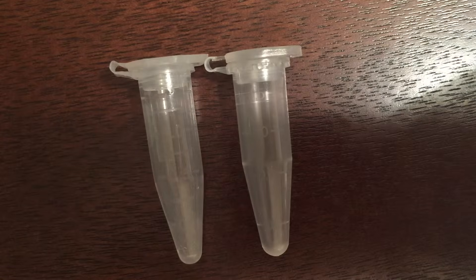Hello, this is Joe with Sycamore Life Sciences. I've recently received a few questions from customers pertaining to our micro centrifuge tubes — specifically, people were wondering what differences, if any, exist between our 1.5 milliliter and 1.7 milliliter micro centrifuge tubes. In this video I hope to address that question and provide a little bit of clarity on the issue.